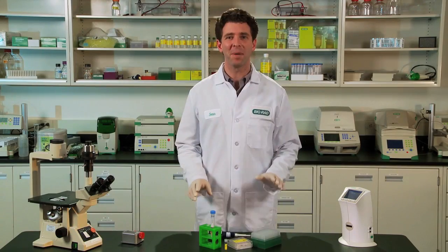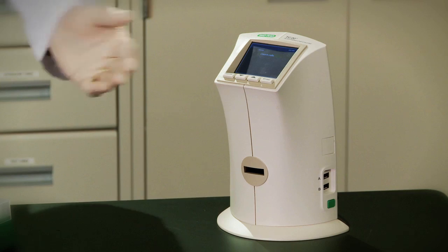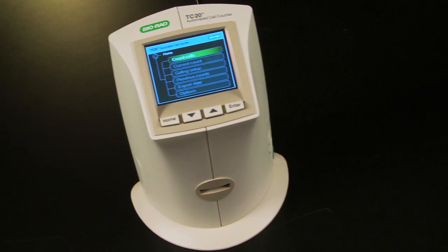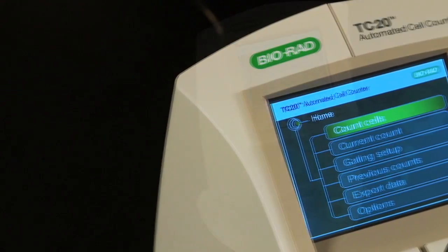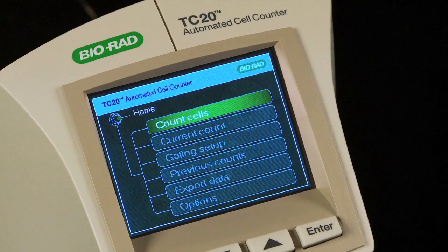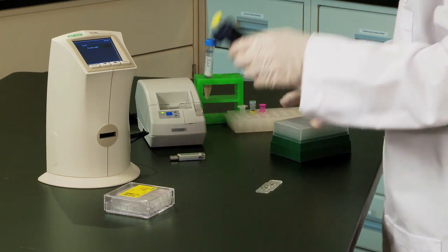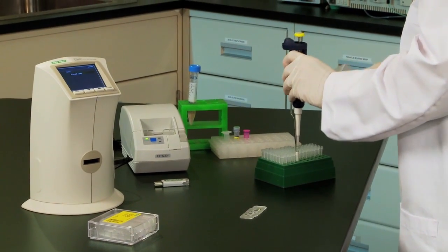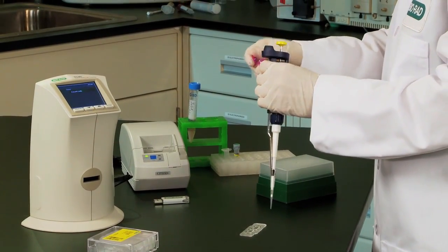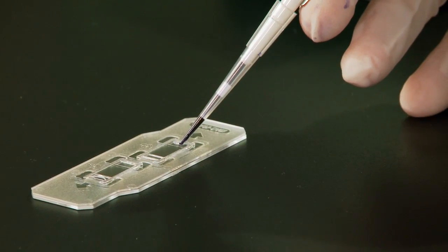There is now a better, more accurate, and much easier way to count mammalian cells using the Bio-Rad TC20 automated cell counter. The TC20 is truly automated, with innovative autofocus technology that increases accuracy and reproducibility by eliminating a subjective manual focus step. The TC20 cell counter is very easy to use — simply load the counting slide with 10 microliters of cell suspension and insert it into the instrument. The TC20 cell counter provides a cell count in less than 30 seconds.